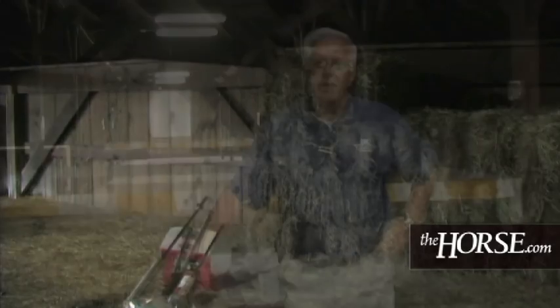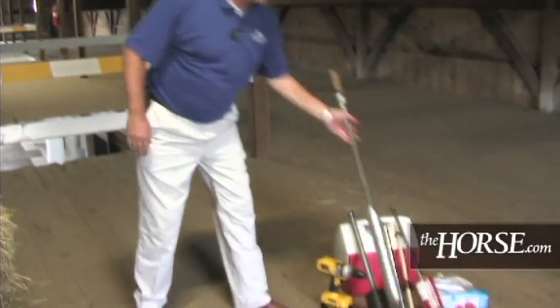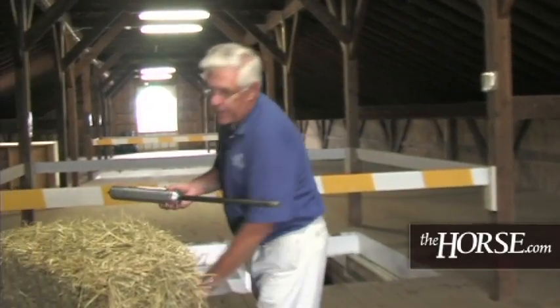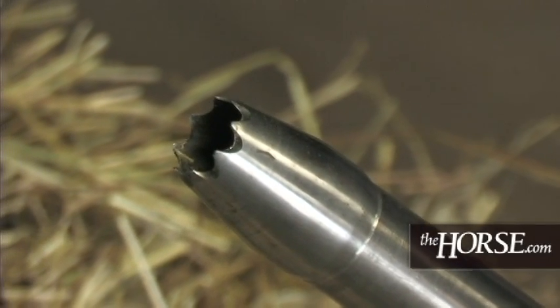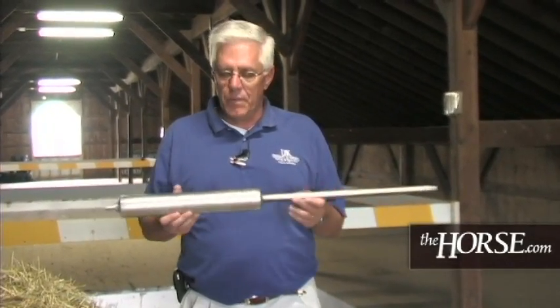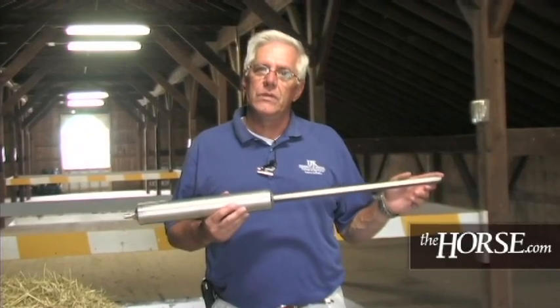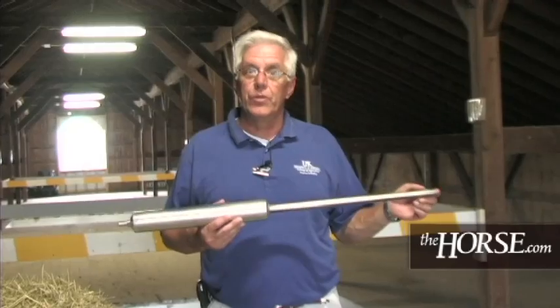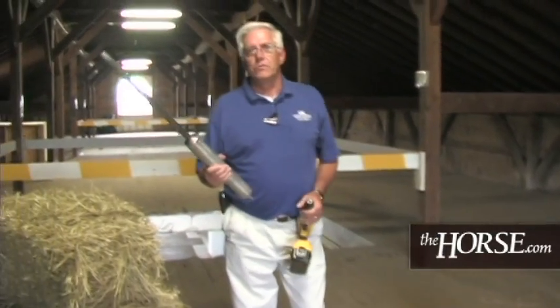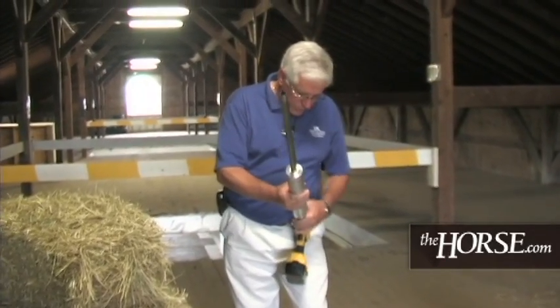Now we're going to proceed and actually take a sample — a core of hay. We're going to use this Colorado State hay probe. No matter which hay probe you use, you always want to make sure that the cutting tip is sharp. After you take a number of samples over a period of time, these tips will get dull. So depending on the probe you use, always remember you'd like to have one that's replaceable or able to be sharpened. These probes can be used with a brace and bit, with a corded electric drill, or today we've got a cordless drill, which is handy when sampling quite a bit of hay.